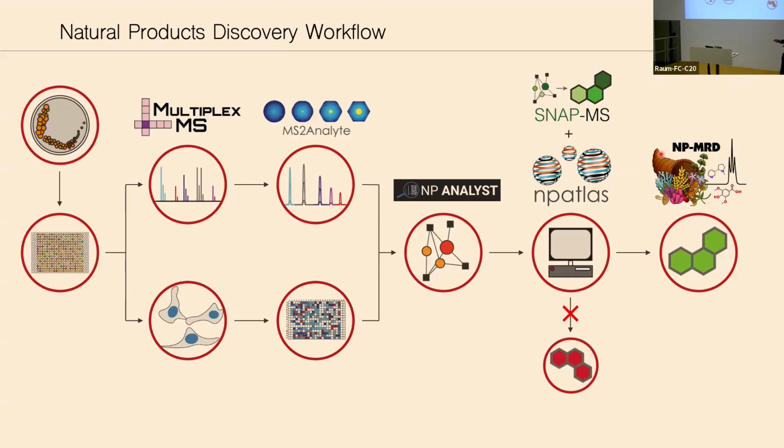So what I'm going to do today is I'm going to focus on the N part of this pipeline. So I'm going to tell you a bit about sort of database development in these two areas. First the Atlas and then the NPMRD project. And then I'll tell you a little about SnapMS and how it works and how it uses the Atlas as its frame of reference.